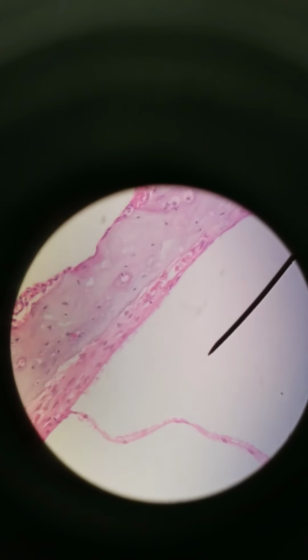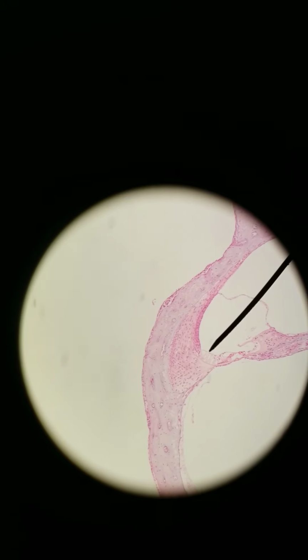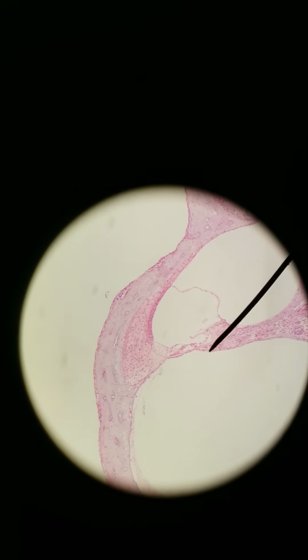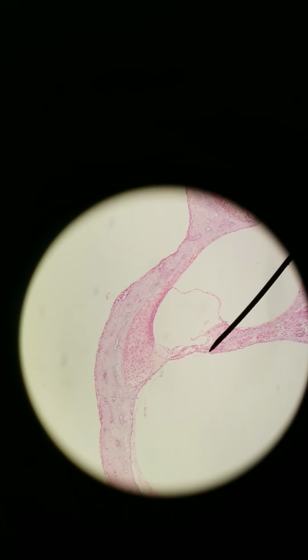Up here is scala tympani, vestibuli, media, tympani. This whole area here, and let me go back out one more time, it'll be easier to see. This whole area here of cells, this collection of cells, where I'm trying to trace right now, is found within scala media. This region of cells here is the organ of Corti, or the spiral organ.